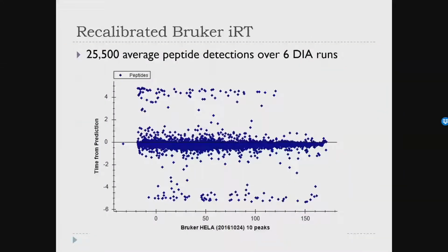And then what I did was I imported into Skyline, exactly what you're going to do, import the data into Skyline, and then I just recalibrated the IRTs based on where the peaks were instead of where the spectra were identified. You just built a library where you built the IRTs out of where the spectra were, right?